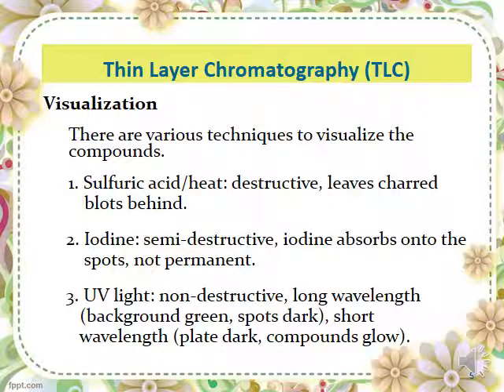So how do we visualize spots? It's easy to visualize with our eyes if the components are colored. What if the component is not colored, meaning colorless? We can use these three techniques to visualize the spots.